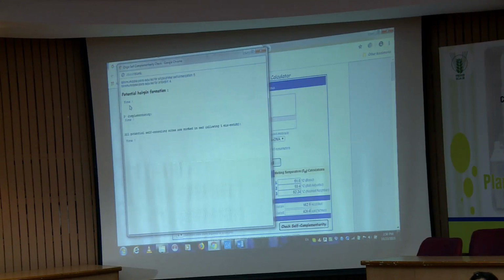Right. So, this is one step, how we have to design our primers for PCR amplification. Now for PCR, what all do you want? You want the template, which you already have, right. Primers you have already designed, forward and reverse primers are with you. dNTPs you want, enzyme you want, and buffer you want. You can select any of the companies for that. Many companies provide cocktails also, or you can do it individually also, right.